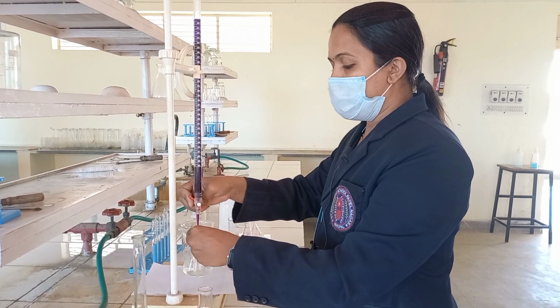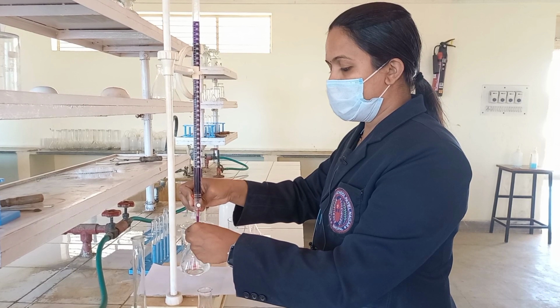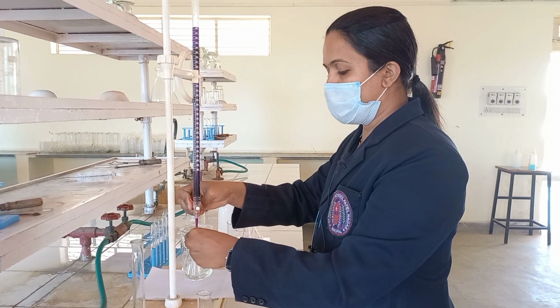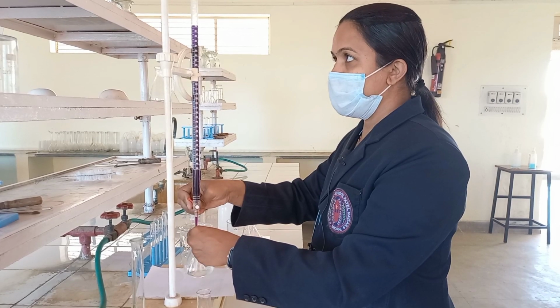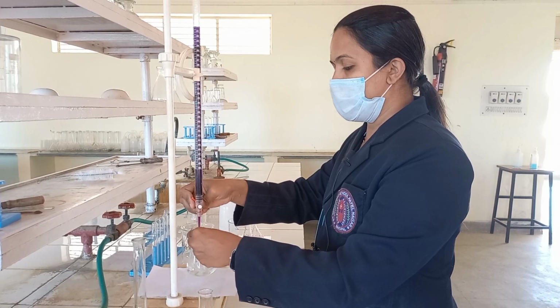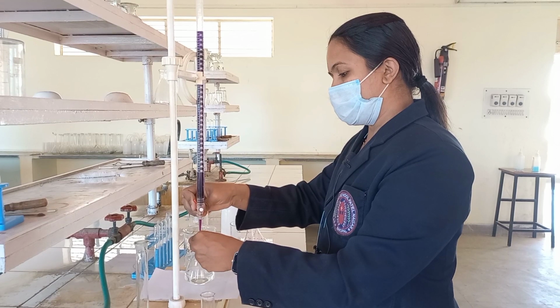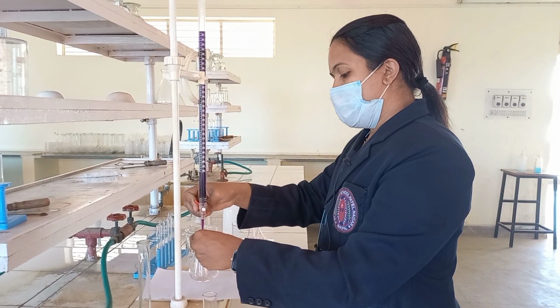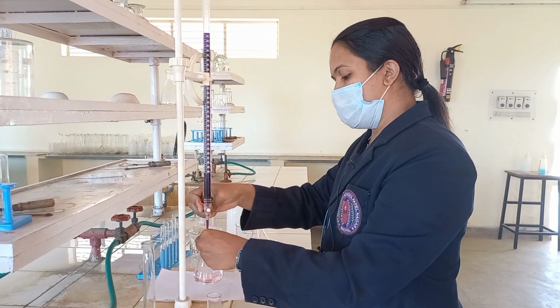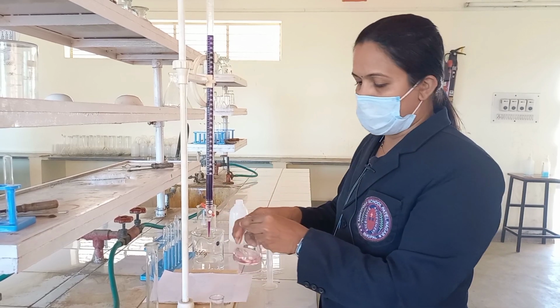Start adding the solution dropwise. When you add the solution dropwise, it will be easy for you to get the exact pink color. See, you have to be patient while doing this titration, because we want the color to be light pink. An extra drop of KMnO4 can change its color to dark. So as I am taking the second reading, I will show you the exact light pink color.